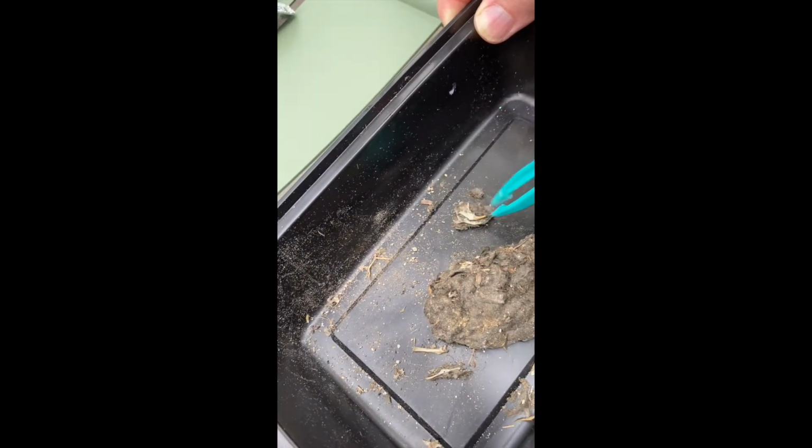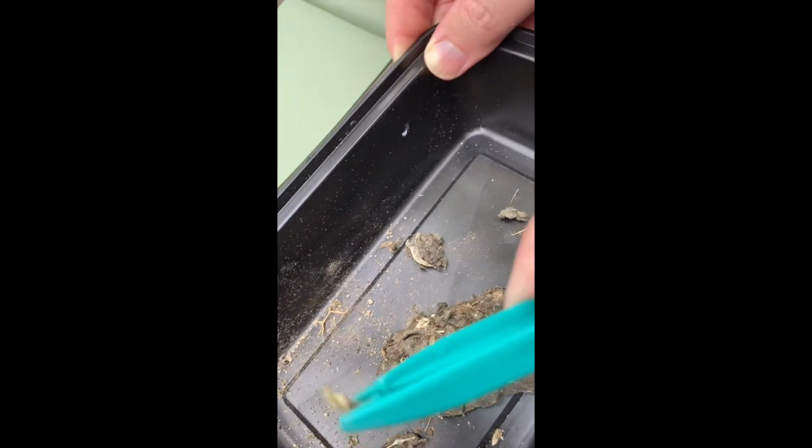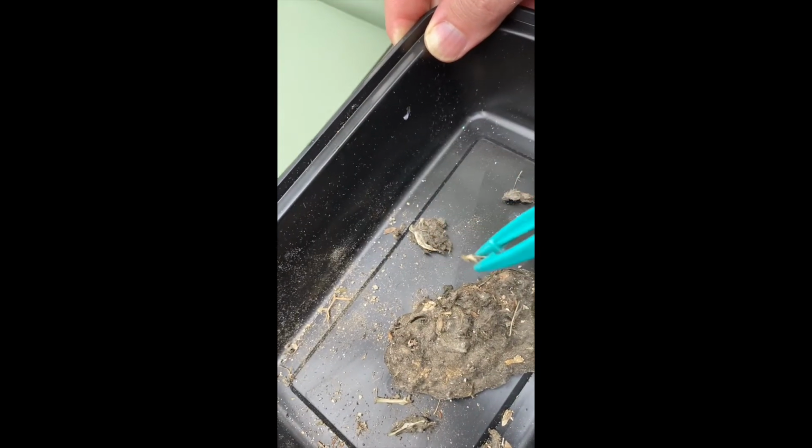Great horned owls will eat rodents whole, so that when you dissect the pellet, this is what they cannot digest. So this is the fur, the bones. That appears to be some kind of maybe jawbone? I think so. Of a rodent. There we go, there's a good, interesting piece of jaw.